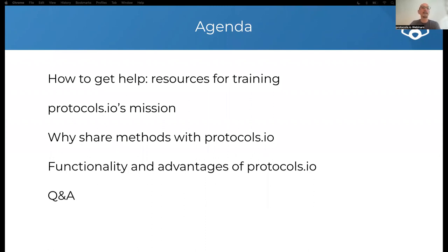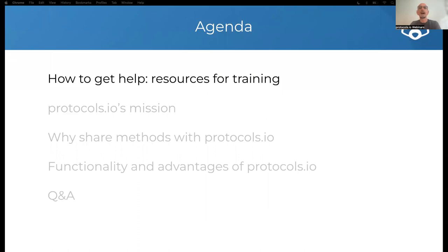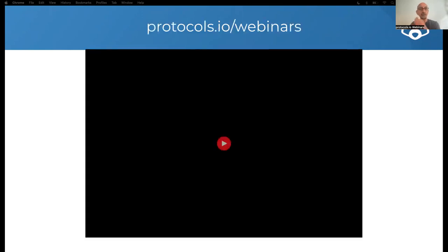And for that reason, I will share with you now some resources that we have put together, some training resources that you can browse for more information. First of all, we have these live stream webinars. We run different webinars covering diverse topics. Some of the webinars are tailored for new users, and some of them for more experienced users.